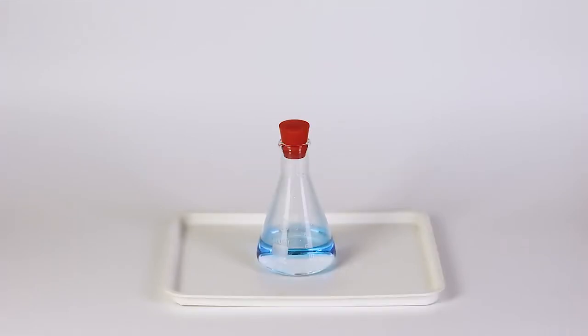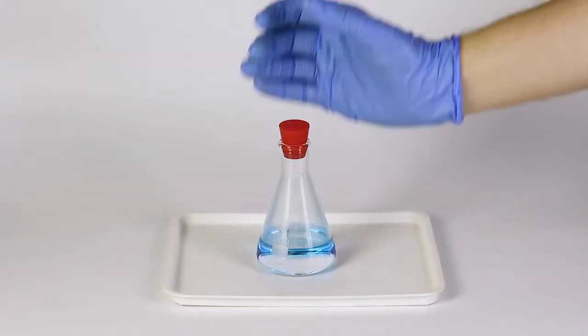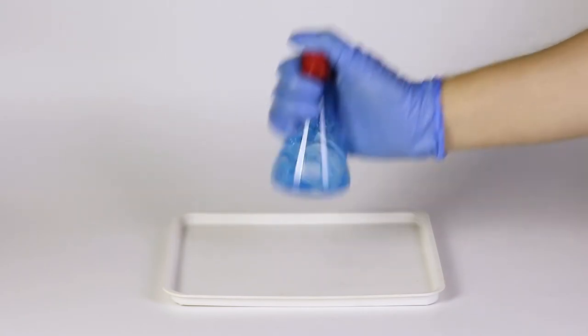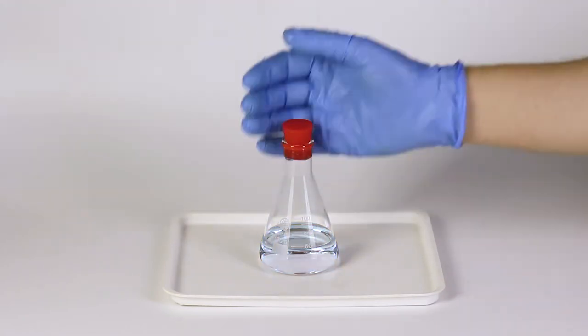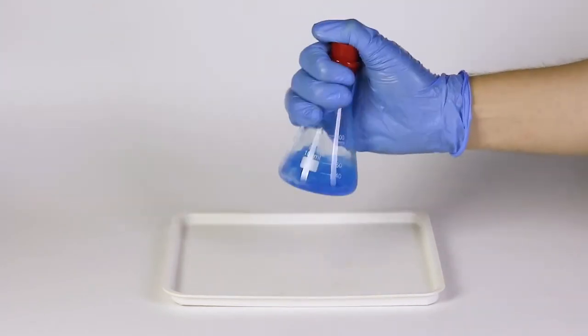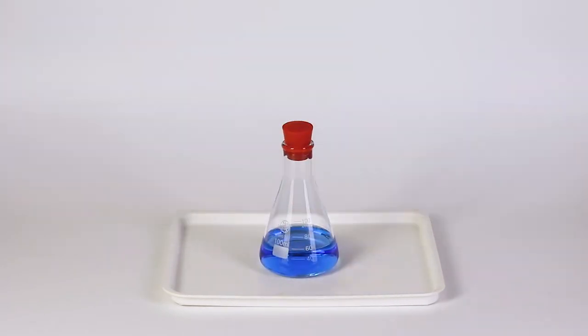When the solution turns colorless, thoroughly shake the flask and the solution will turn blue again. If the flask is left for a while, the liquid will once again turn colorless, and when shaken again, it turns blue.